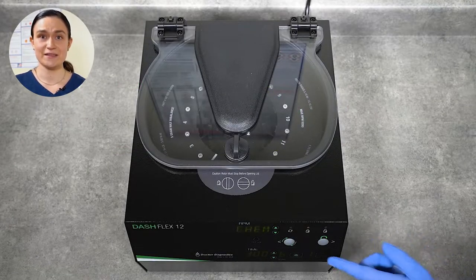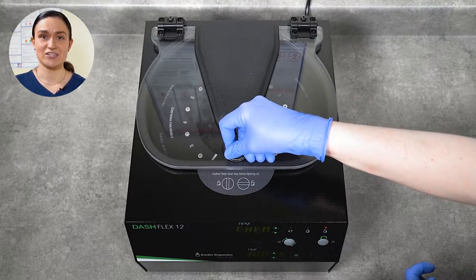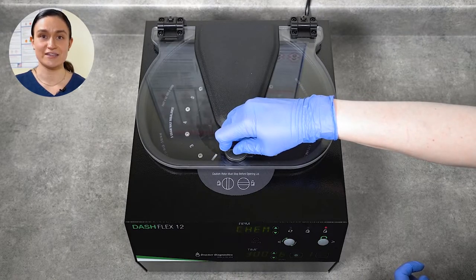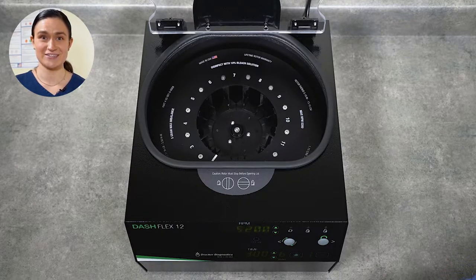Once you press that Stop Unlock button, you'll be able to open the lid by pressing down gently on that lid latch and turning it a quarter turn counterclockwise. Gently lift the lid open. You will see the rotor inside. Your Dash Flex 12 arrives with the rotor already installed — nothing additional to do here.